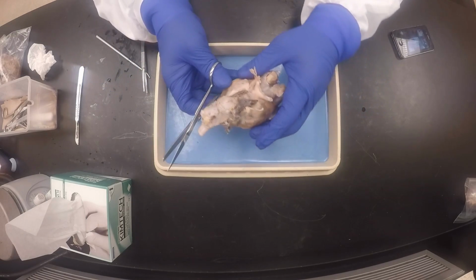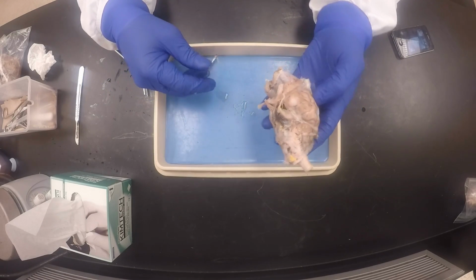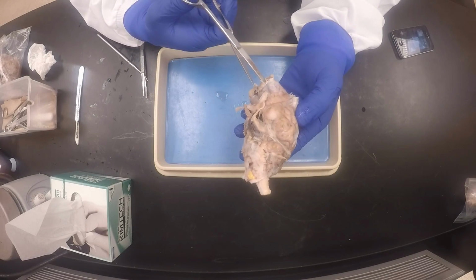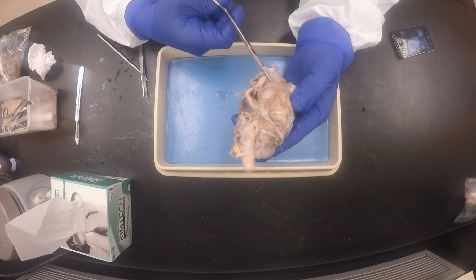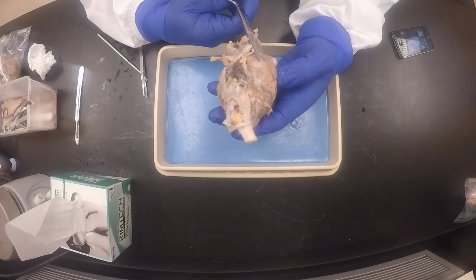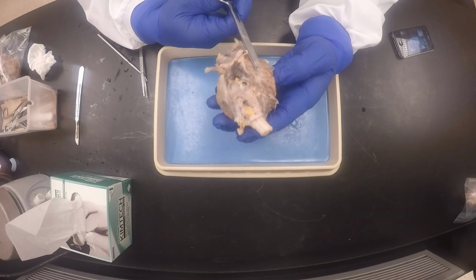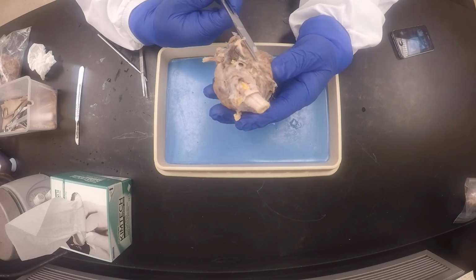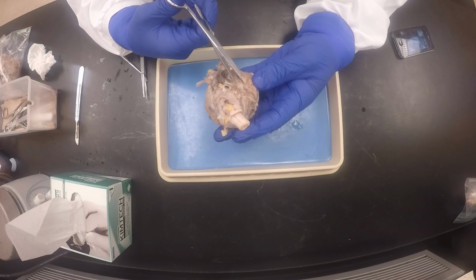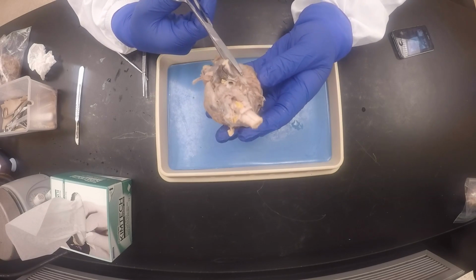Okay, so we've done the one side, and then you go again to the other side and do this again. Put it in there. Make sure you're not damaging your brain on the bottom. Do you see how I'm using my scissors flat so that I'm not damaging my brain? I don't want to see cuts on your brain, okay?